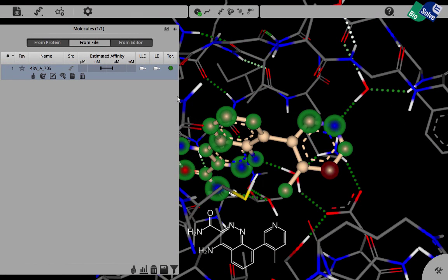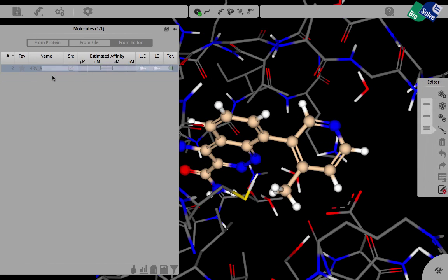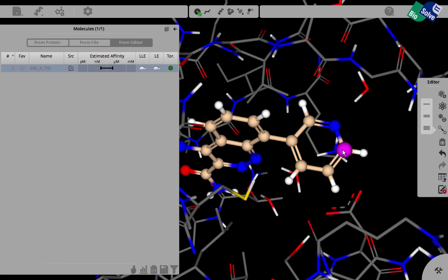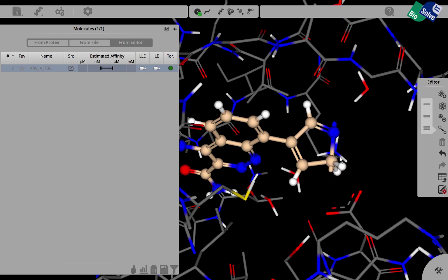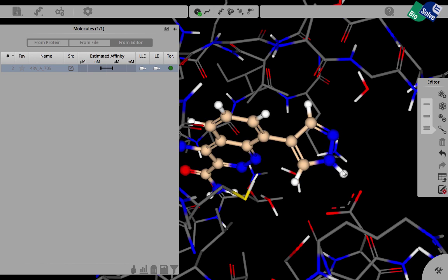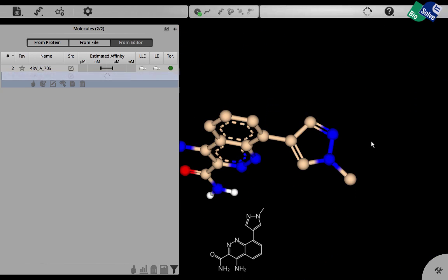Since we don't have a crystal structure of this compound number seven, let's now start to modify this and create it ourselves by editing this compound number eight. The first thing we do is remove this methyl group and we open up the ring. We form a bond between the nitrogen and the carbon. We make this a nitrogen by simply typing N on the keyboard and we add a methyl group to the N. Leave the editor.